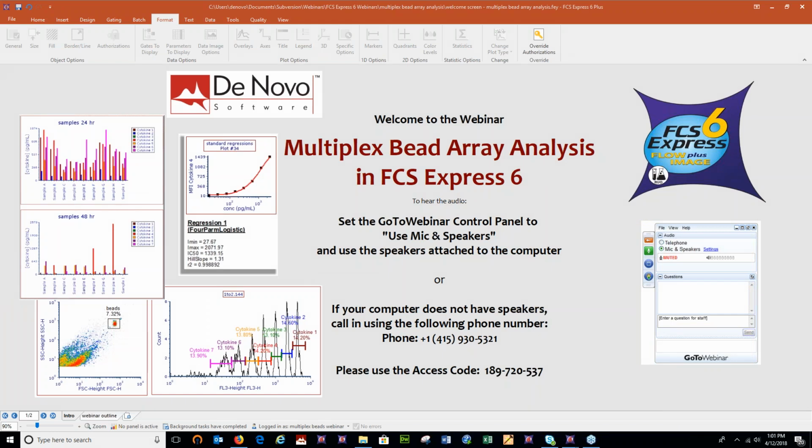Okay, well, thanks so much for coming. I know a lot of you are analyzing multiplex bead arrays or even single bead arrays, and those come in many different varieties. A lot of companies out there offer multiple kits with different configurations of beads depending on what you're trying to do with immunology or analyzing multiple growth factors or whatever the case may be. There's lots of kits out there, and there's also mix and match type single bead kits or single beads that you can buy singly and then combine into your own custom analysis. Whatever the case may be, it all just makes FCS files, and so you can certainly analyze them in FCS Express with the procedures that I'm going to outline for you today.